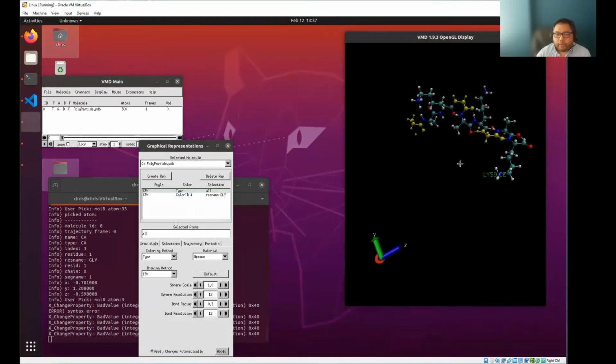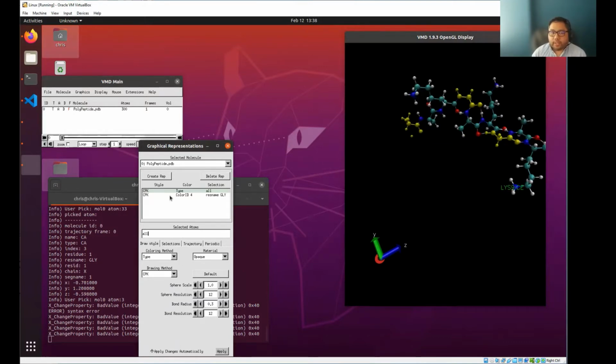You'll probably see later on, whenever I show my little SARS COVID example, I wanted to show the exact genes that I'm mutating, and I'm going to do something very similar to this, but in the new cartoon image that we saw. This is a great way to just highlight specific atoms that you want to show in a system like this. All you have to do is specify exactly what you want to do. So make sure you select the particular item, and you can change anything in the coloring method, essentially.